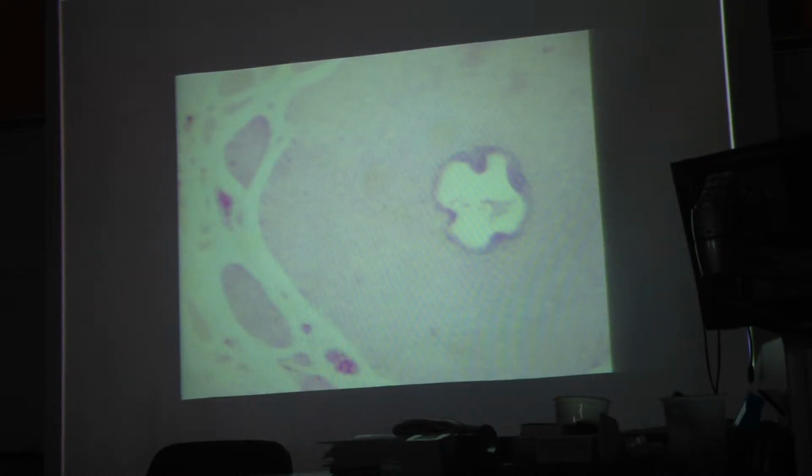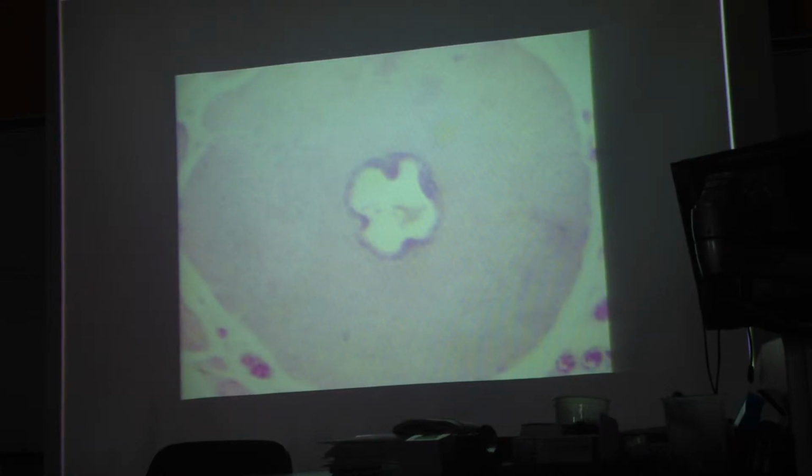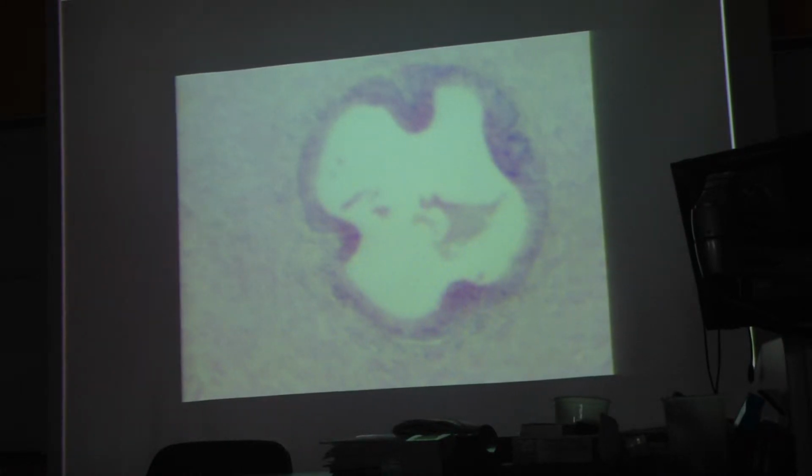Okay? And again, the lining of the ductus deferens is the same as what we saw in the epididymis tubes. What's the epithelium again? What do we call it? Pseudostratified columnar. Again, not ciliated. The sperm we don't really see much here, but it would be here in the lumen. And then here, again, is a layer of lamina propria, like we saw in the tubes of the ductus of the epididymis. And then again, the same three smooth muscle layers and same arrangement.